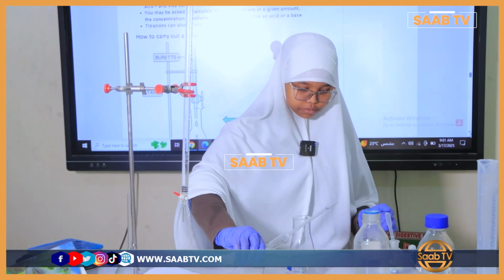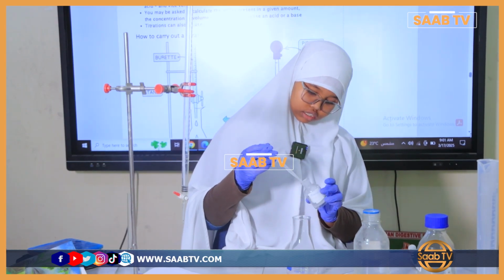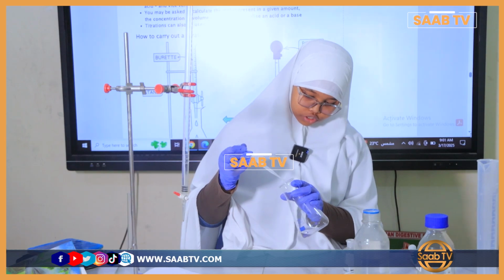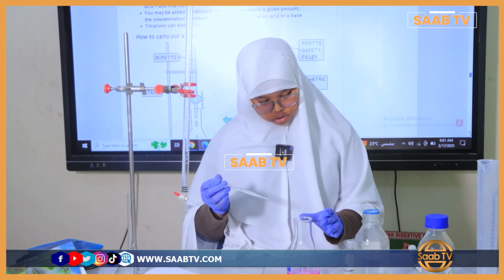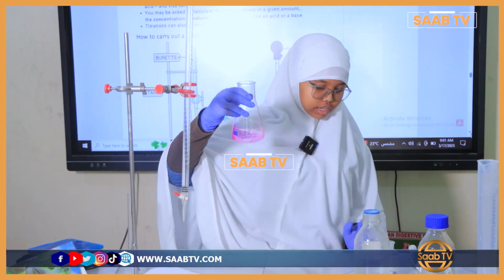Okay, so after that we have phenolphthalein. It's an indicator to indicate the presence of an alkali, and we put 3 drops in. See right here we have a pink color. That is the color of the alkali.